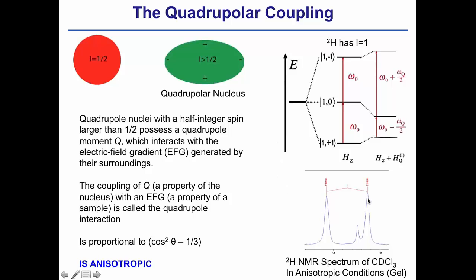In order to see if your sample is anisotropic, or if you reach an anisotropic stage of your media, you should see a nice doublet in the deuterium NMR spectrum. And this tiny signal is something that, in my case, when we developed the compressed gel, we cannot avoid, and we will talk about that.